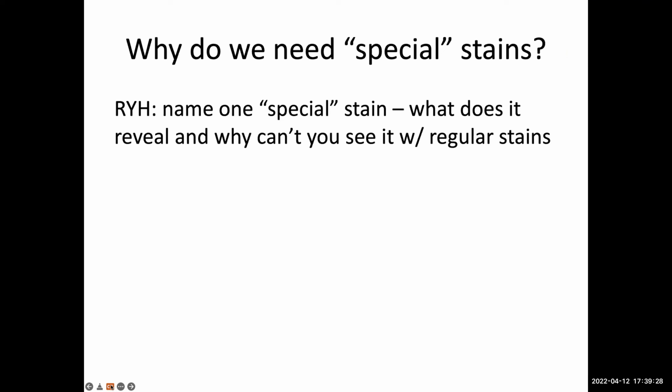Endospore stain. Yes. And why do we need a special stain for that one? What about the endospore makes it difficult to see using just a simple stain? Because it does not readily take up stains. That's right. It doesn't readily take up dye. It's got a very tough spore coat, so the dye can't get inside. So we need a special procedure to see it. Good job, you guys.